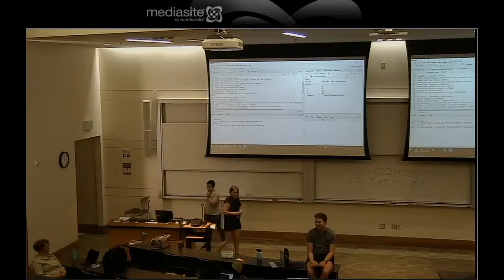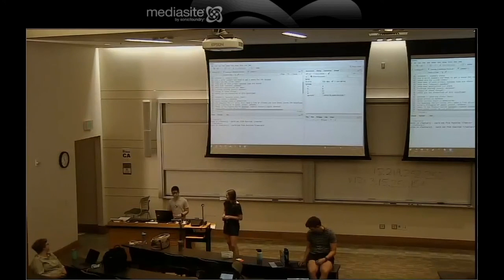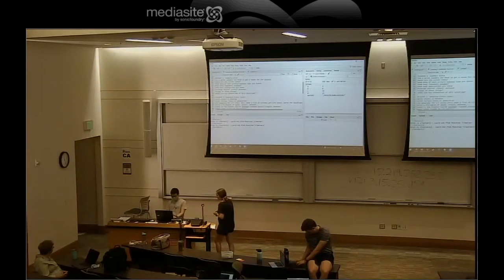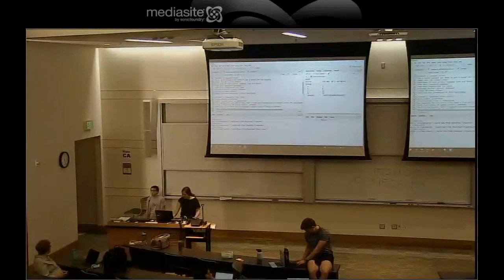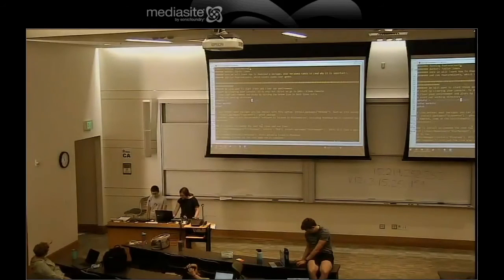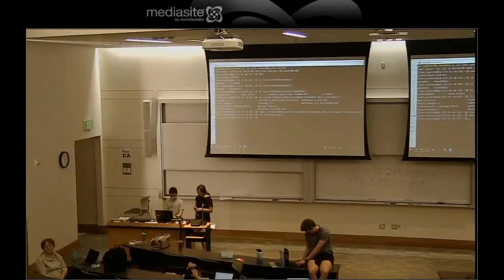No, it's all good. I didn't want them to try to dispatch an R script, although they probably still will. I didn't know how to navigate to it. Just do it with sbatch: run R and then feed it the file. You mean two scripts, like an R script and an sbatch? Would you mind getting me the scripts? It's in the shared scripts. You're going to build an sbatch to run that for them?